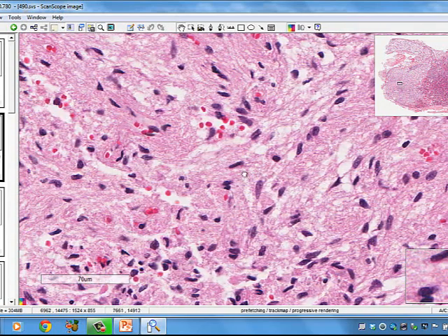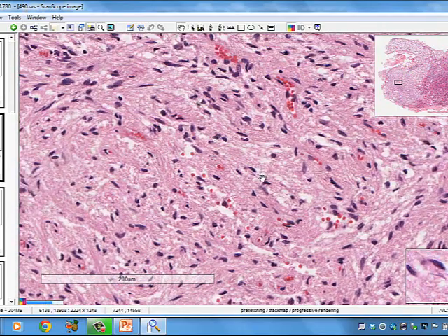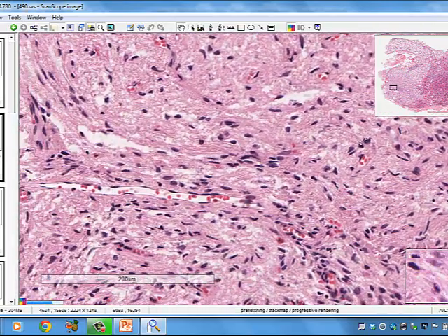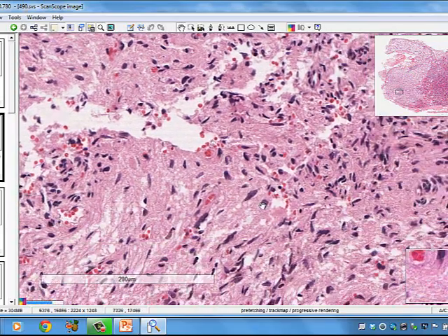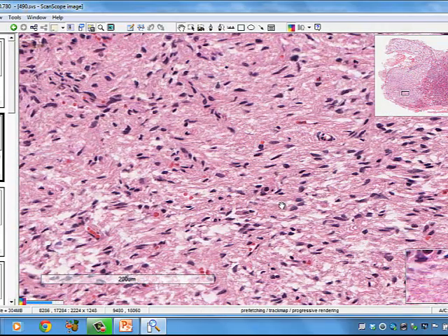However, if you look over here, we'll be able to see the pituitary and the pars nervosa, and we should be able to see some Herring bodies in through here. These are blood vessels that go in through there. You do get vasculature even though you don't have a portal system. There must be Herring bodies in here.